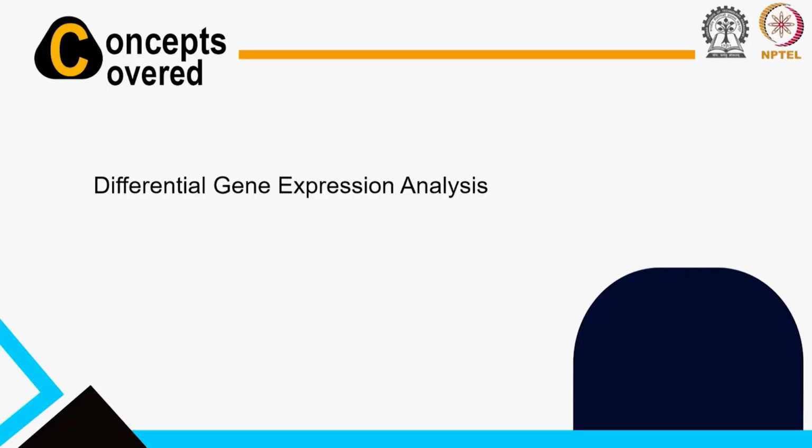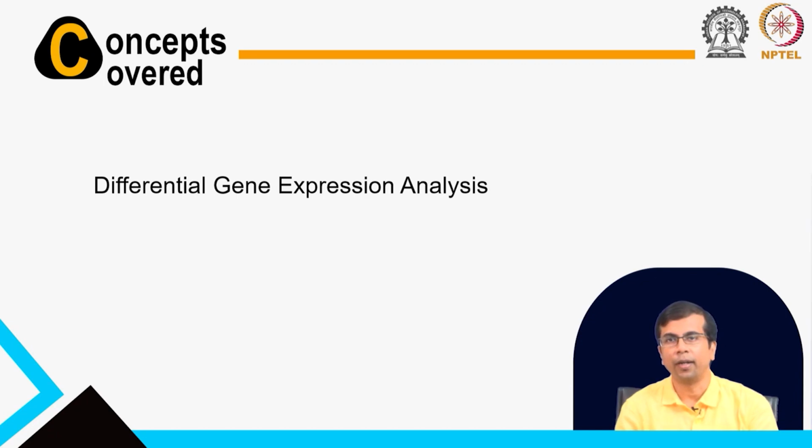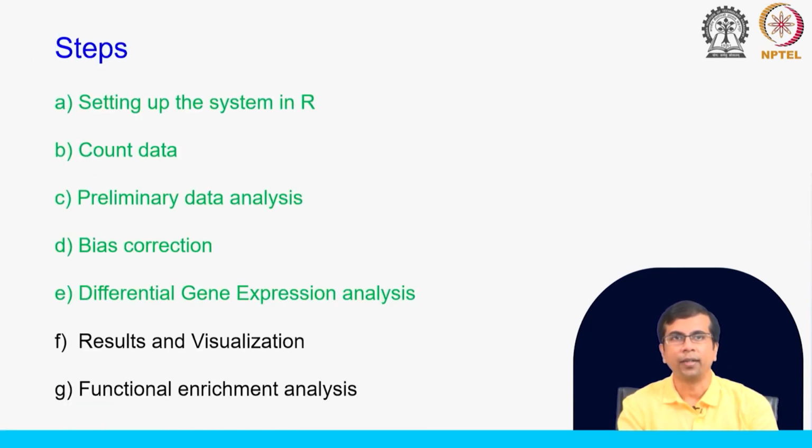We will cover the first part of this differential gene expression analysis. There will be a second part where we will cover differential expression analysis when you have spike in samples. The normalization we can do differently and that we will cover in the next class.